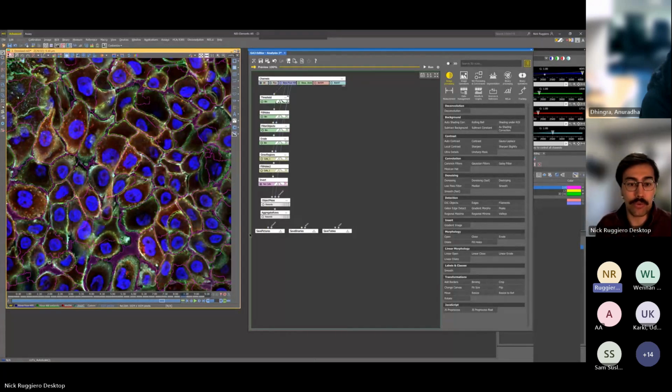We tried to keep this one simple. Not all your GA3s have to be super complicated.